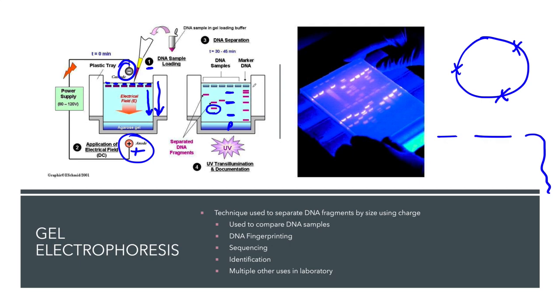On the right, we usually run a DNA marker. This is a set of standards, and these are fragments of known base pair lengths. I know exactly how many base pairs are in each of these fragments, so that if this fragment here contained 1,200 base pairs, I would know that this fragment from my plasmid also contains 1,200 base pairs, because they ran the same distance at the same time in the same electrical current on the gel.